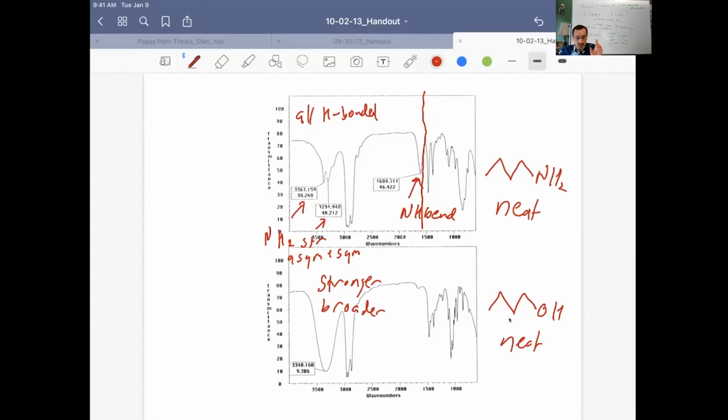And this particular amine, I'm making it, shall we say, easy for you, in the sense that the amine is very small, so you've got a lot of NH2 groups in your sample. If this amine were, say, 40 carbons in size instead of 4 carbons in size, then the intensity of this NH2 stretching band would be about 10-fold lower. In other words, it would be really, really subtle.